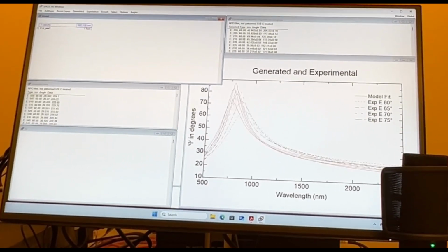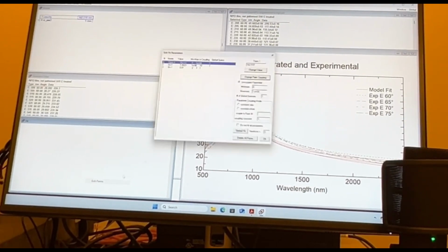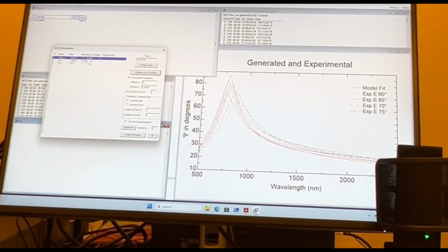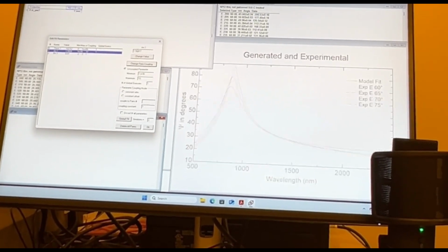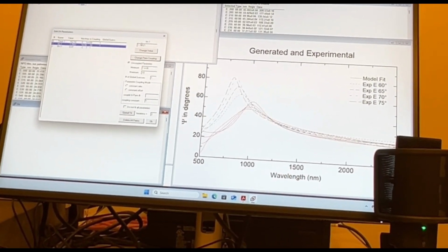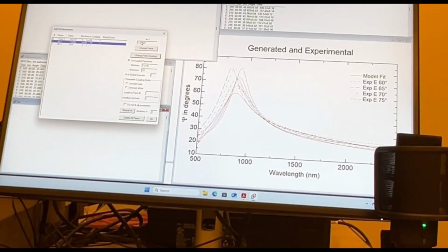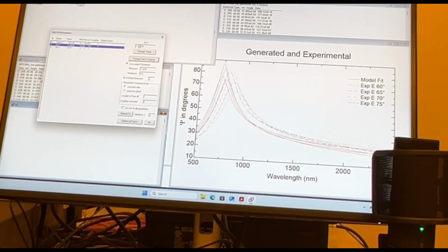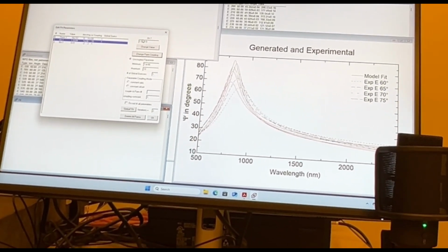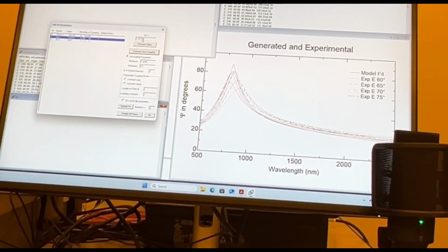So let's get back to about the thickness. But you also notice as I change my index, edit params, and change that A parameter, I can also change the thickness here now. Again, as I get closer to the index of silicon, notice how those dampen. If I go further away, they go up. Now if I keep going down, they came down for a second. You can see there's a little bit of a range here where they went down and then back up. That's because you do have another interface here.